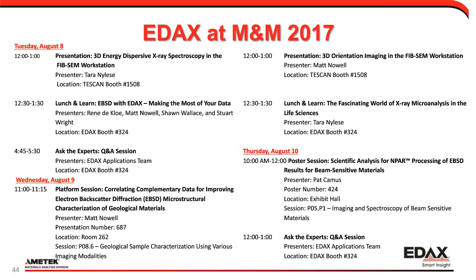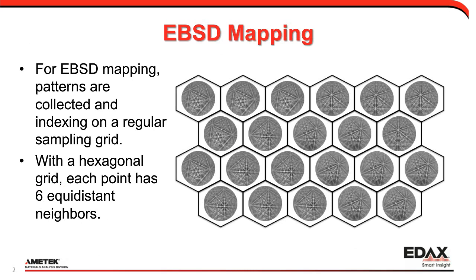If your data set is such that I would need, let me go ahead and change my slide deck to way earlier. So the question is how many points would that actually be averaging? If I zoomed out and started to take a map, let's take a data point. If I started to zoom that out, I would start to lose a lot of detail across that area. In this case, it would be closer to probably 20 data points. I'm not going to do the math right now, but it'd be more data points. You would have more loss of detail probably, and in the end, you'd probably also have more overlapping patterns.